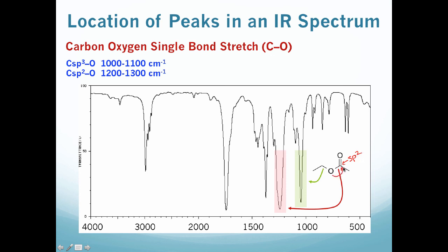That's a result of the bond between this carbon and oxygen, and that's very distinct right around 1250. But we also have the sp3 hybridized carbon, and that carbon and an oxygen will also have a stretch, but that is right around 1050.